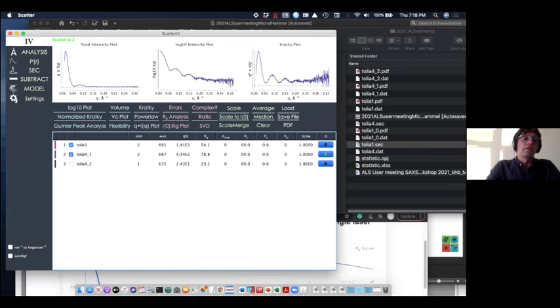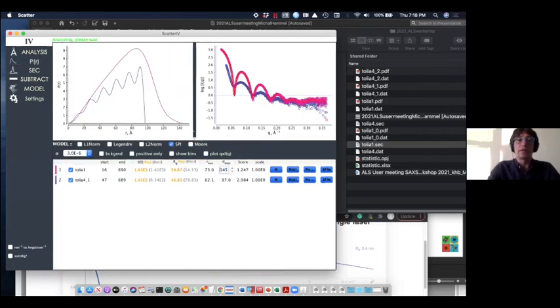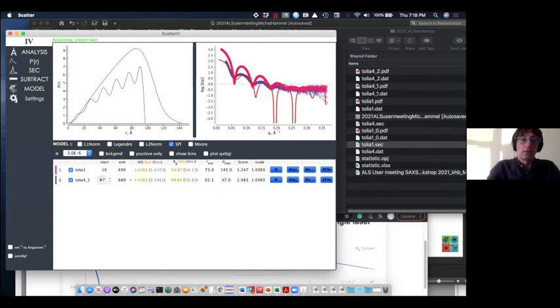To model this kind of system is a little bit more tricky, and we're going to talk about it tomorrow, but it's a very fast way to see in real space how those pair distribution functions are different. You just, oops, it's not going to work now, but you need to trust me.